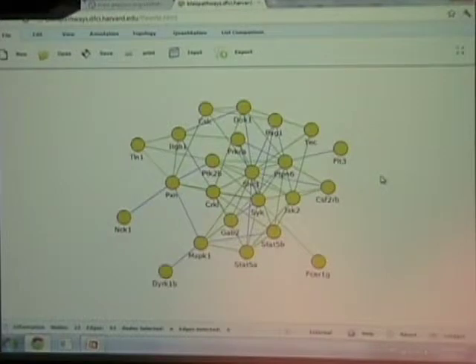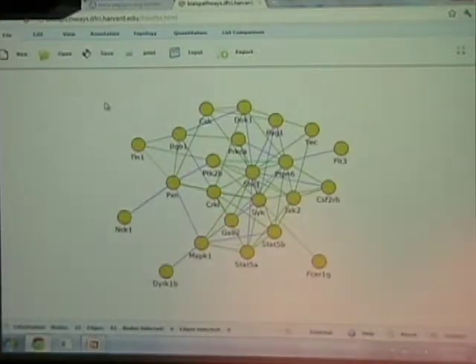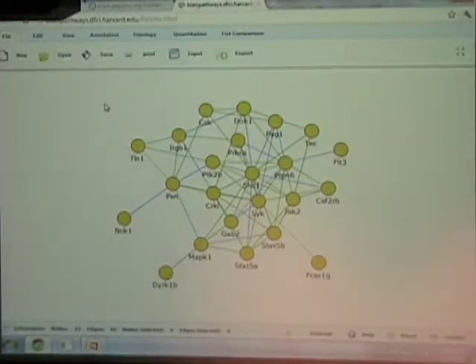I'm going to use the example graph, partially so you can redo this afterwards at your leisure. This is a subset of the proteins found in this experiment that I just set up. There's a bunch of things that you can do here, which you can also do in genomic type websites.